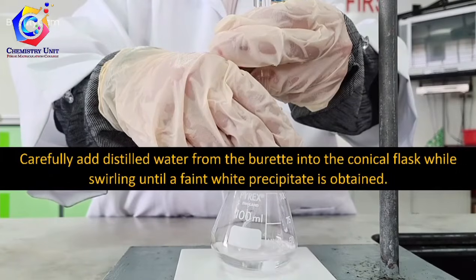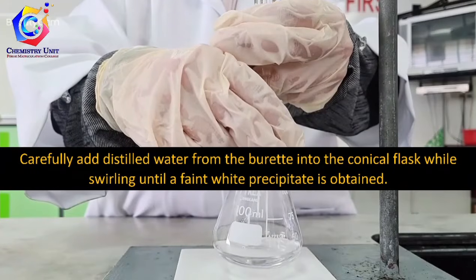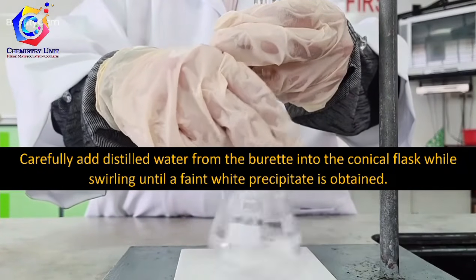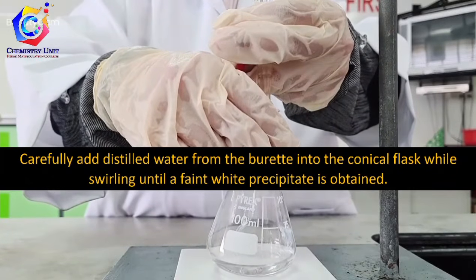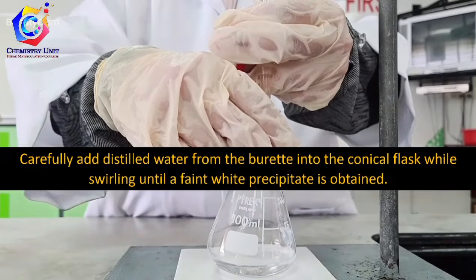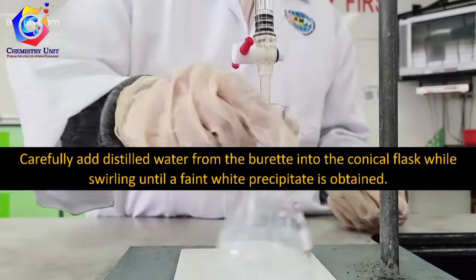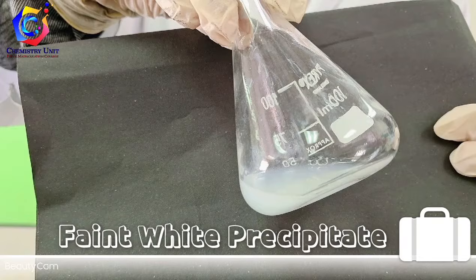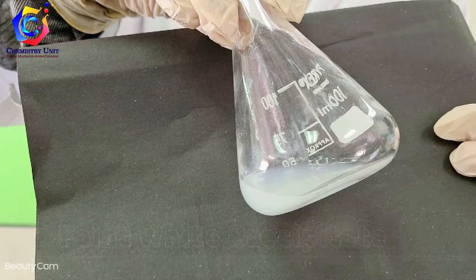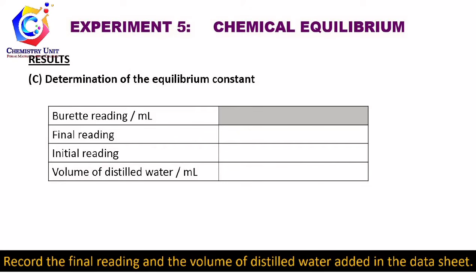Carefully add distilled water from the burette into the conical flask while swirling until a faint white precipitate is obtained. This is what we want, the faint white precipitate. Record the final reading and the volume of distilled water added to the conical flask.